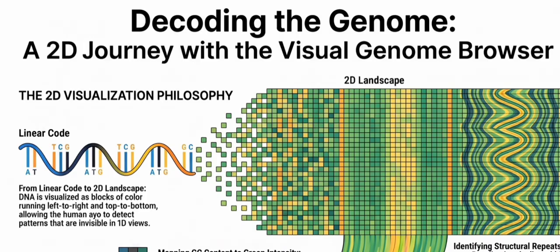The source material specifically highlights an example using an individual from the 1000 Genomes Project, a massive public dataset, individual NA12878. Yes, a very famous, heavily studied genome. When you load NA12878's VCF file while you are zoomed in on a specific gene, the visual interface completely shifts its focus. The underlying reference DNA is still visible for context, but prominent visual markers populate the screen, explicitly highlighting every single variant present in that specific individual's copy of the gene.